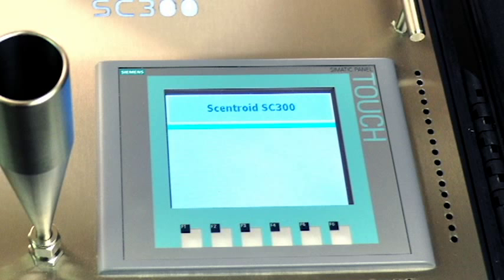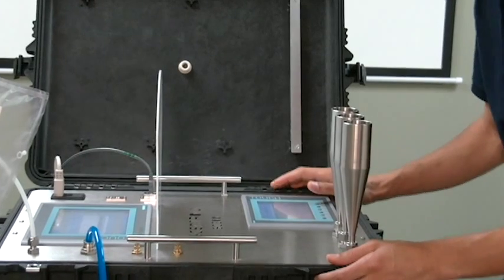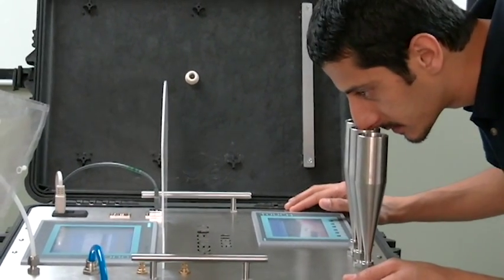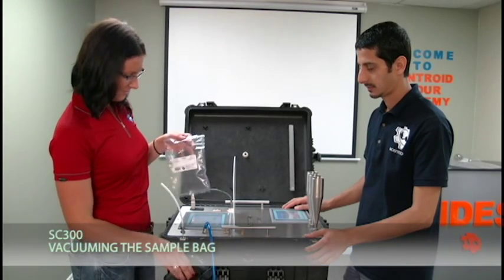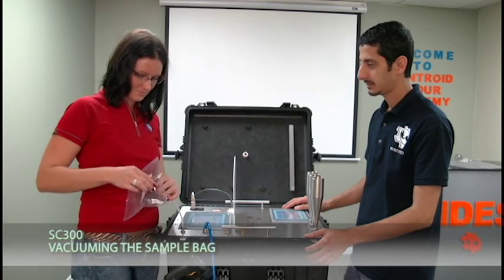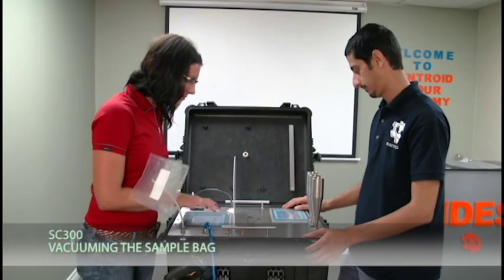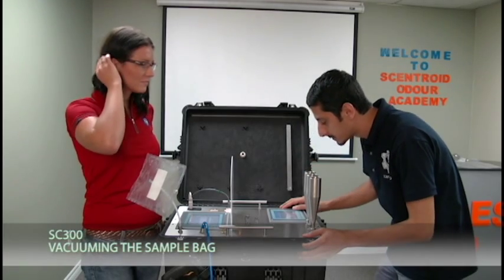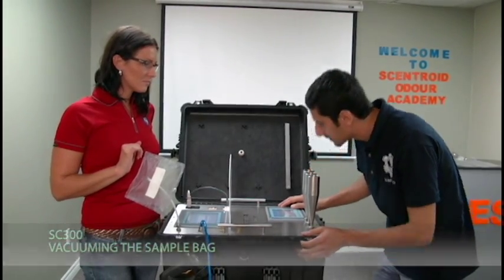The panelist station has a dedicated 6-inch screen and 3 sniffing ports for a true triangular test mode. The SC300 is very user-friendly — simply connect the bag to the sample port and start a new test. The panelist will be given all the instructions necessary and can then sample each sniffing port and enter their selection.